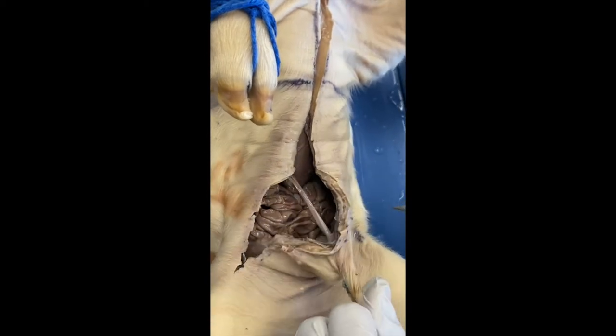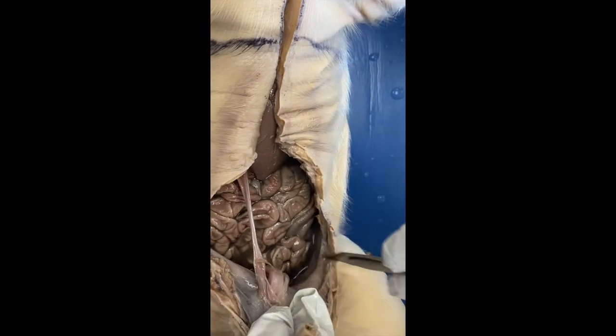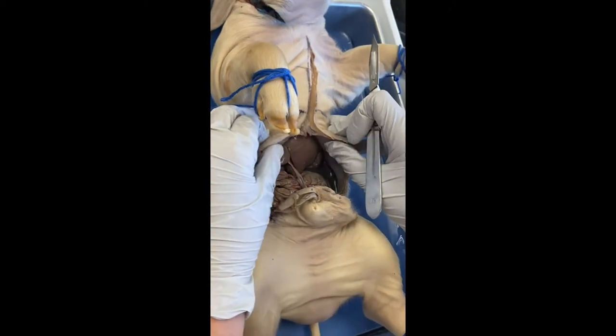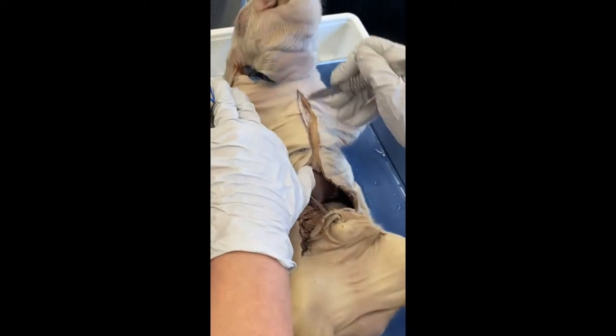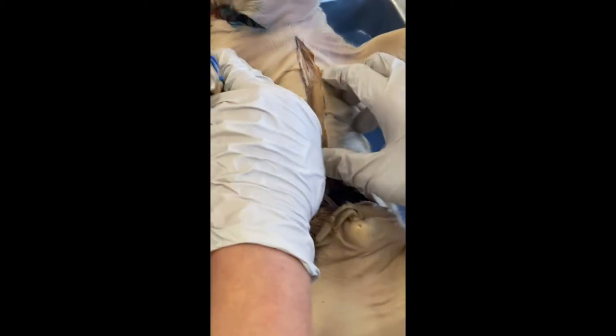Again, I usually pull on the umbilical cord to keep everything up. It's good. We're gonna see how I do. I do not want to nick any organs. You guys, I'm nervous. I'm gonna make this look good. And then here, I was very delicate in how I didn't press too hard on the chest. And then when I get to this point, I'll put this down. And Miss Harrington, you're being wild here.